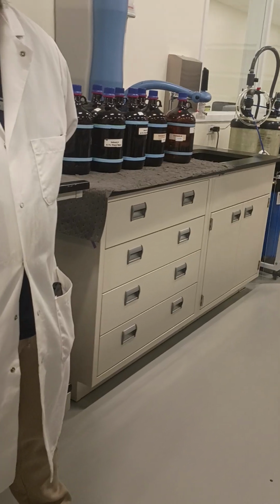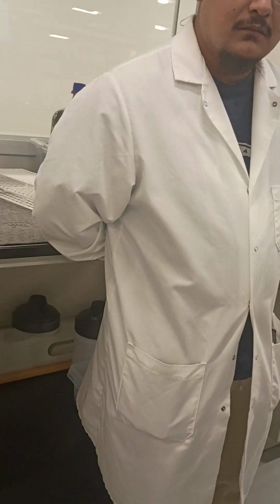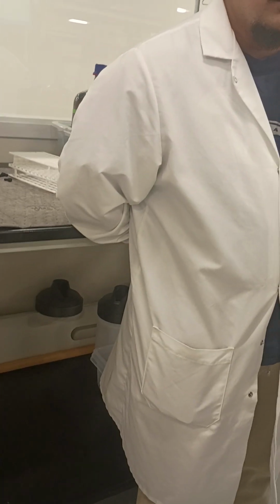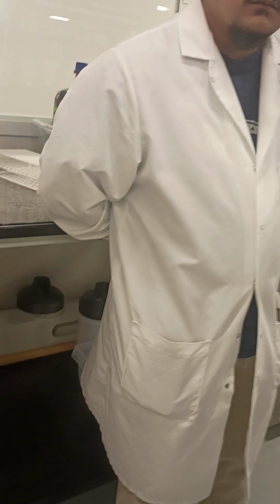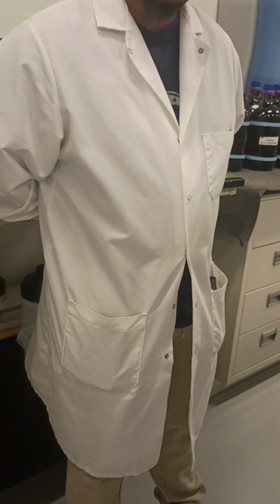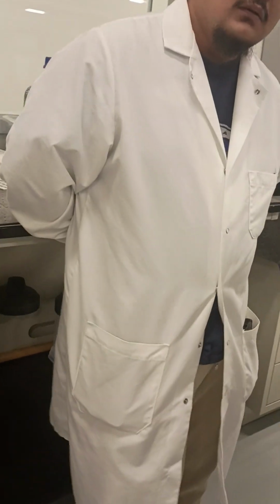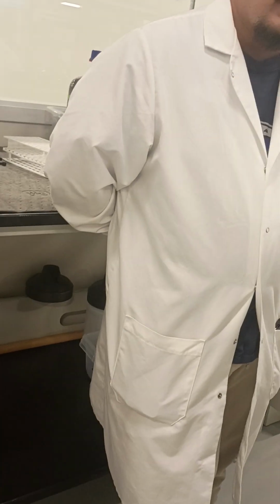So basically, what we do here, this is the purification side. It comes from the synthesis. They have a bunch of amino acids, and the customer orders a sequence with multiple amino acids. They use a resin and a program with all the reagents to put that together. The peptide is actually made on the resin. Then they cleave the peptide from the resin.